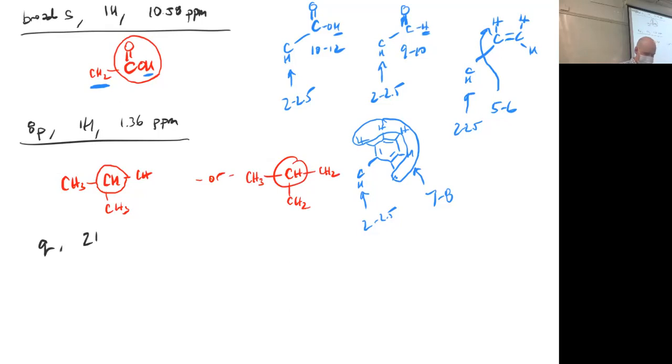Caleb, you have a quartet. It integrates to 2H. It is at 2.52 ppm. You're gonna start with CH2. Great, I will start with the CH2.